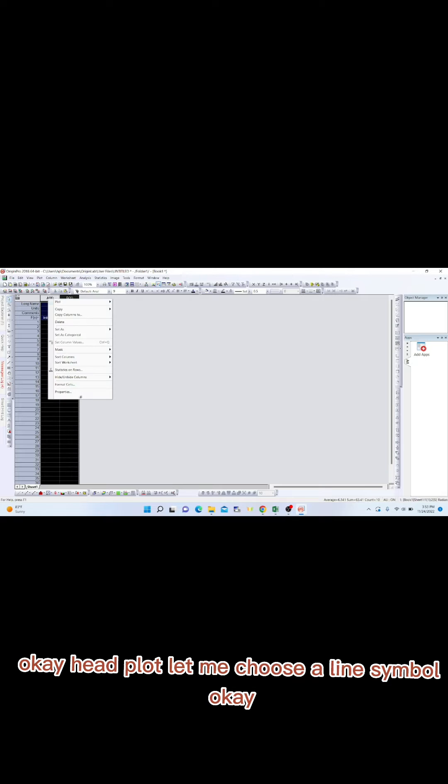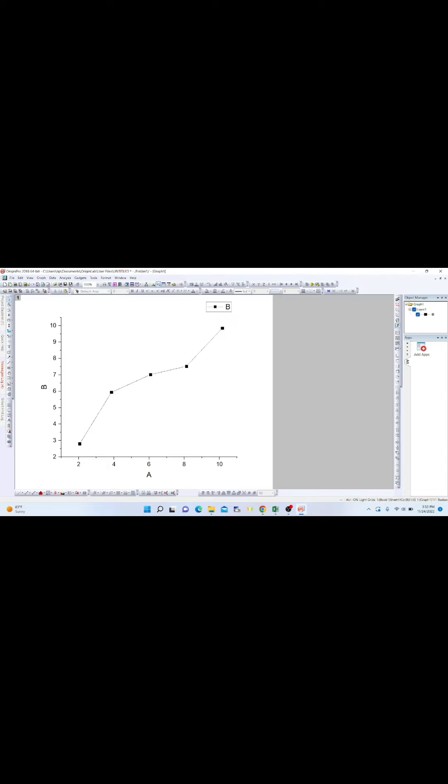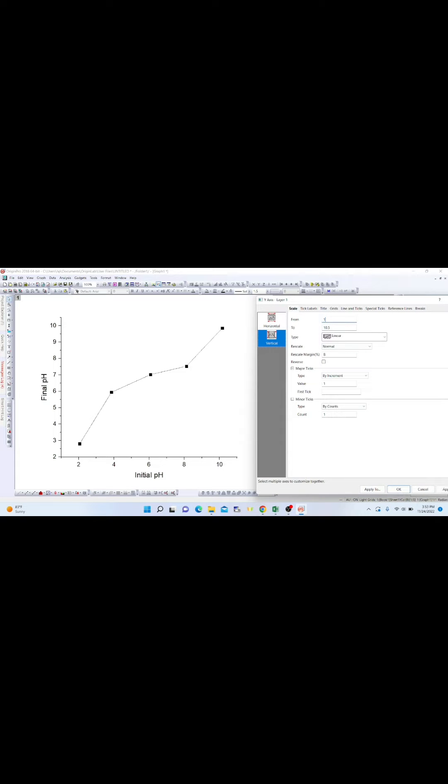Now what we will do is open up the Origin software and then plot this. We'll copy these values and paste here. These values are now pasted. Select these, then plot, then we choose line and symbol. Now we'll name this axis and make some modifications. Let's start this from 2.